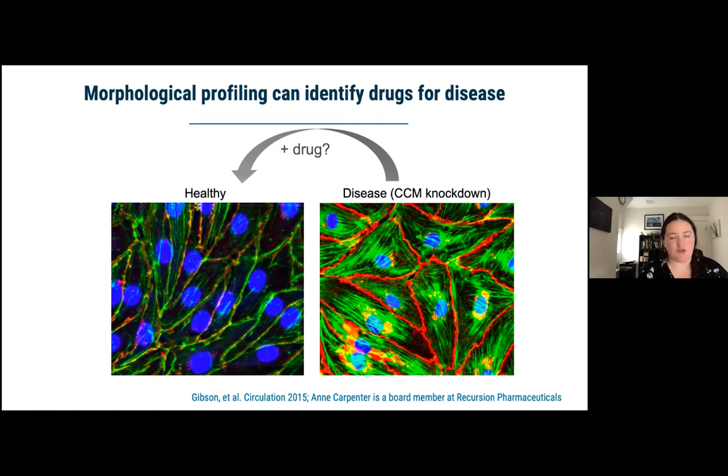And then they pitted the humans against the computers by giving both top hit lists to mice and seeing how the mice did. And it turns out that the human experts did not actually pick out the right features of what a healthy cell really looks like. Their drugs did more poorly than the drugs that were picked by the computer as creating the most healthy-like phenotype. The computer was able to not have the human bias and actually focus on what a healthy cell truly looks like at a pixel level and suggest better drugs to treat a particular disease.